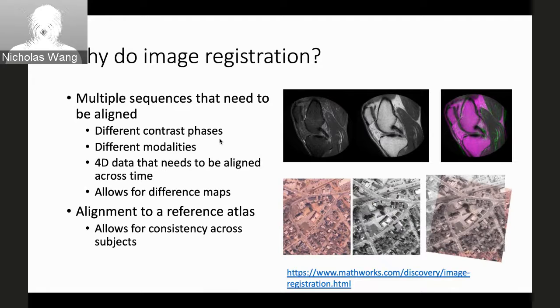Again, 4D imaging, you also need to align it. And so this kind of static or this kind of affine registration, you can see on the bottom these are MATLAB tools. This is not exclusively through DI-Pi, but there are other tools that can do this as well. But you're trying to put these into alignment so you can either extend the image or provide some consistency across them.